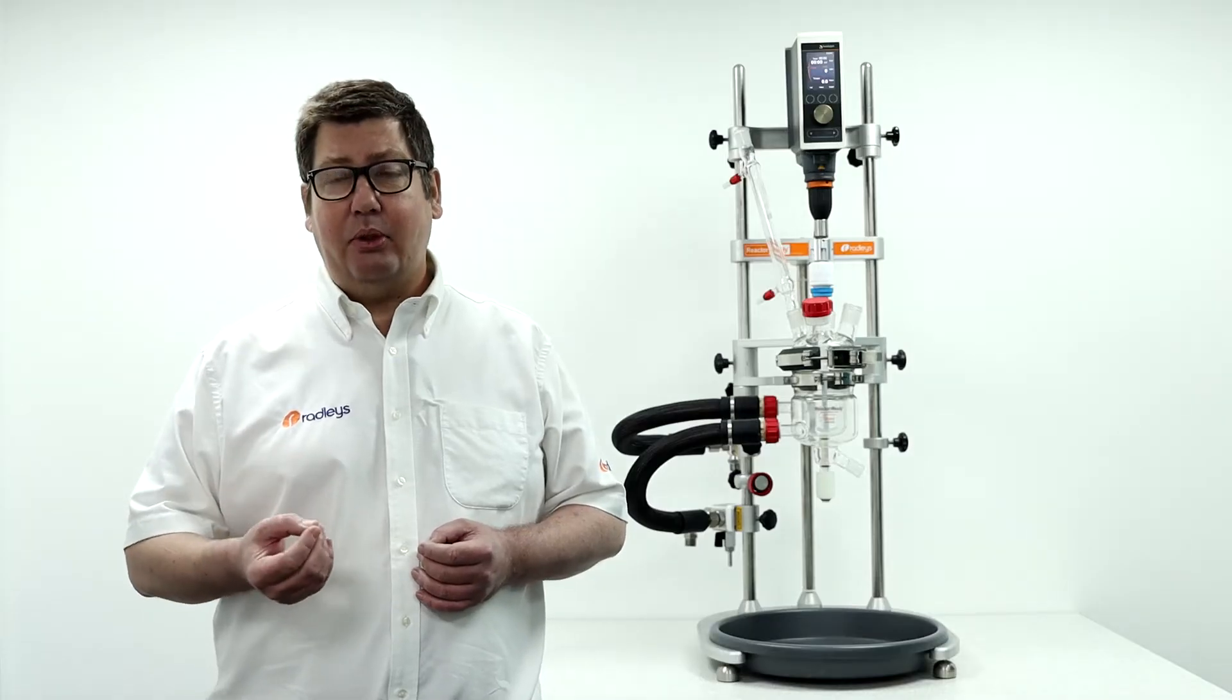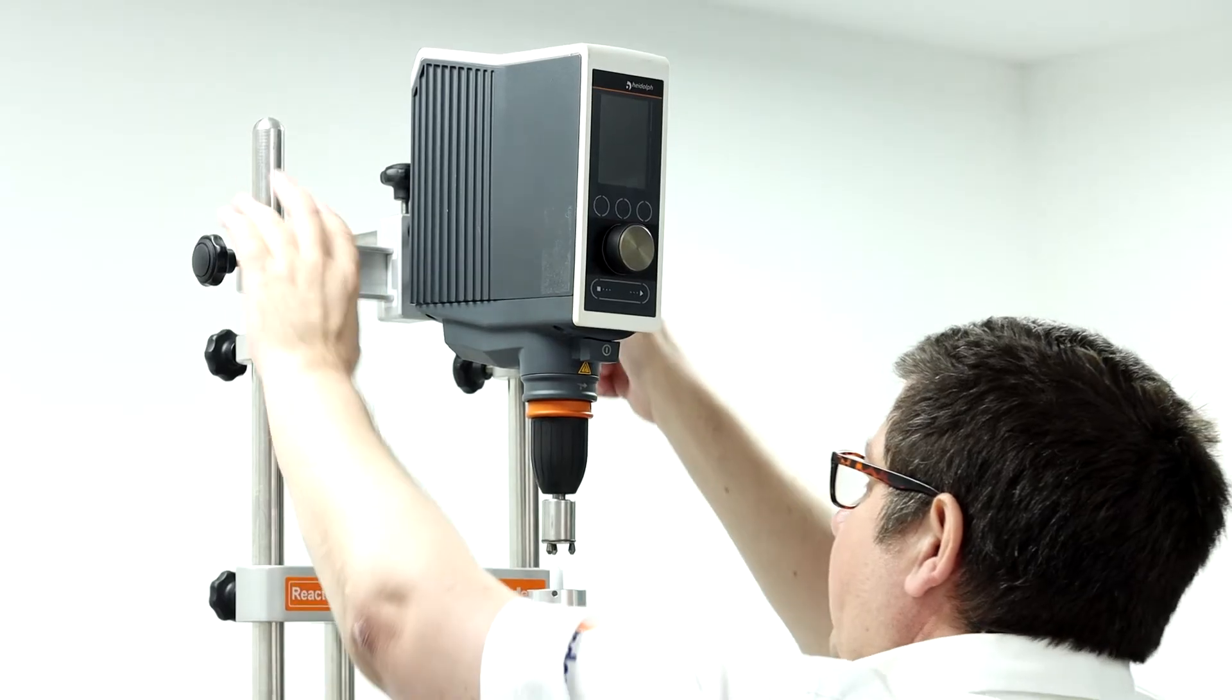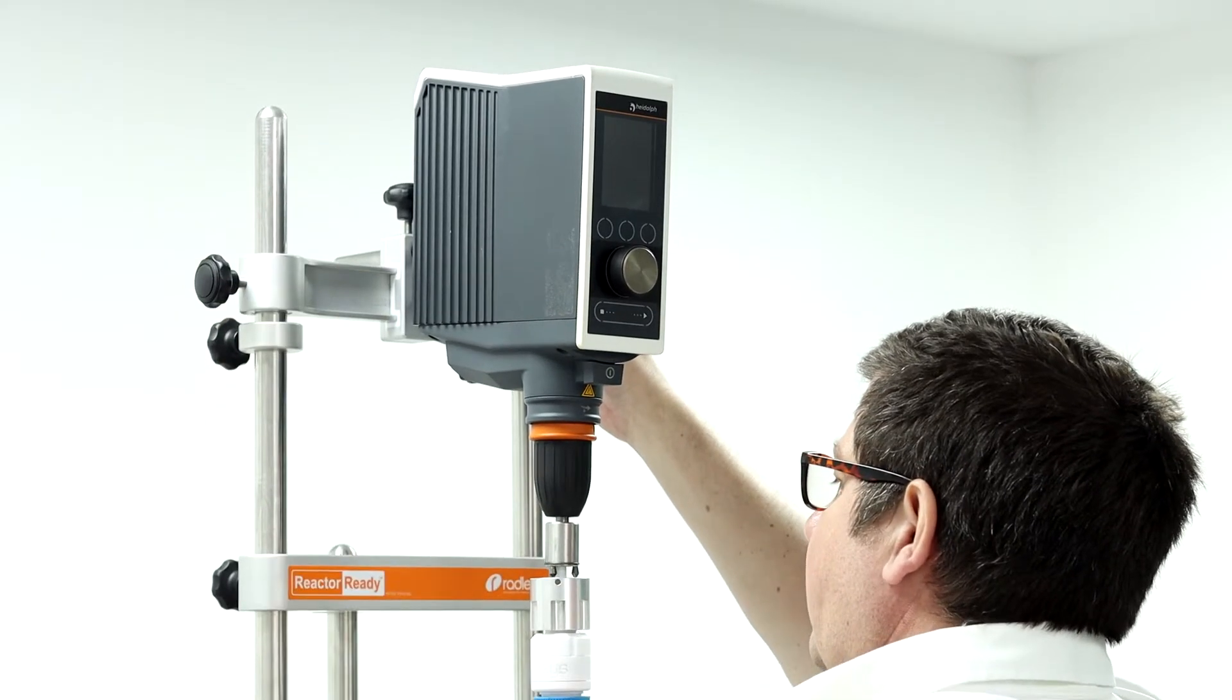There are newer systems available which overcome the traditional issues of stirrer misalignment through use of a drop-in coupling.